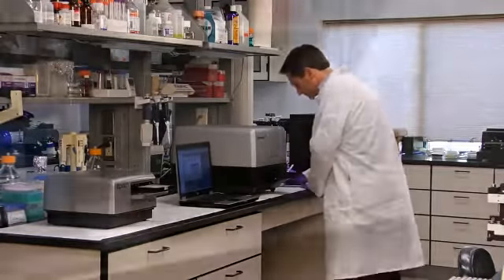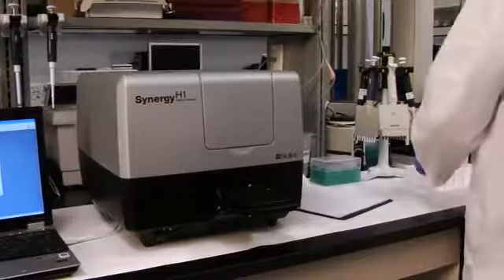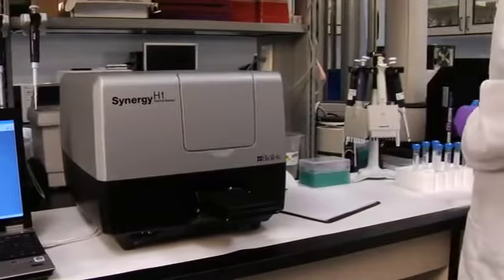This video presents Biotech's Synergy H1 and how its unique hybrid optical system addresses these key requirements.